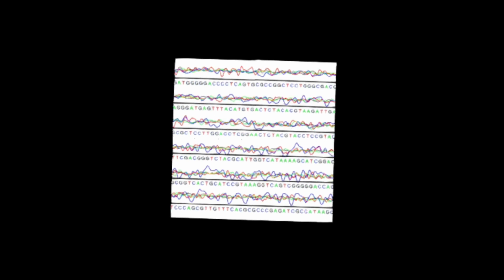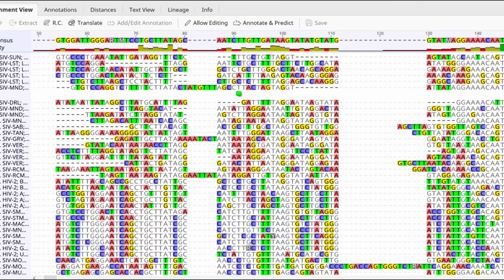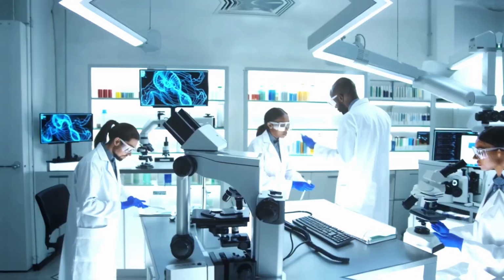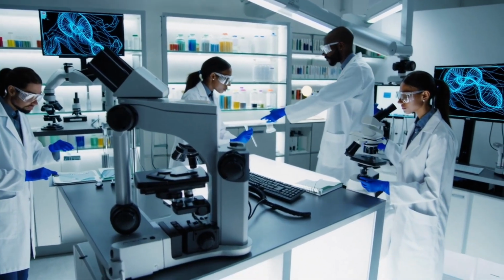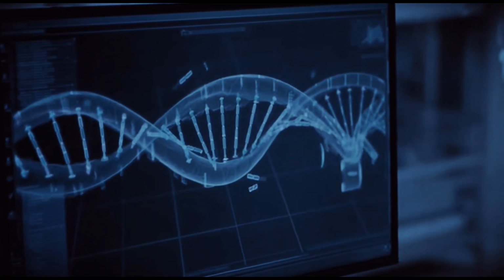Each tiny DNA fragment, called a read, is compared to a reference genome, a complete, previously sequenced genome from a known species. The software searches for the best spot where each fragment might fit, a bit like figuring out where a torn page belongs in a familiar book.